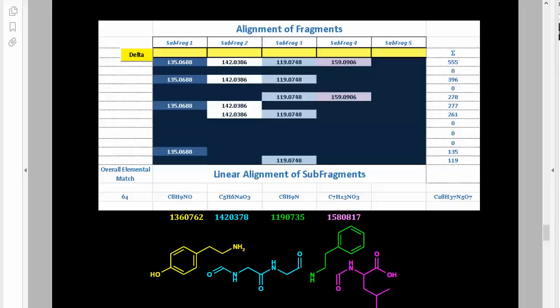We've been going from an accurate mass MS-MS spectrum to generating partitions. These partitions can give us an idea of what the original molecule looked like. Similar partition searching uses the same principles, but essentially applies partitioning in reverse.